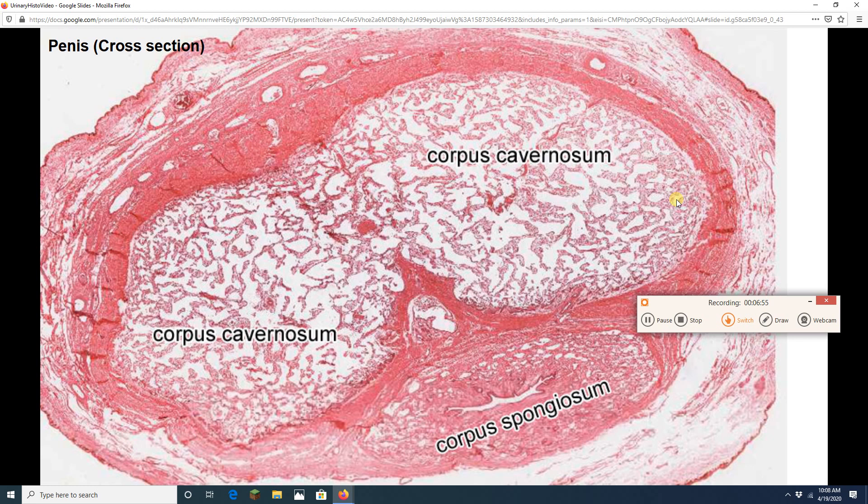And now one more organ to do. That is the urethra. We obviously have a male urethra here. Because as you can read this says cross-section of the penis. When we look at a penis in cross-section, we are going to see three erectile tissues.